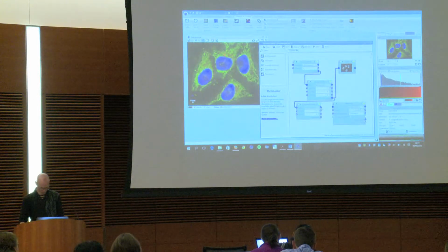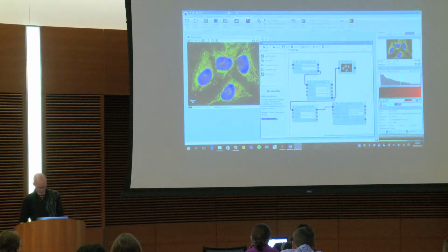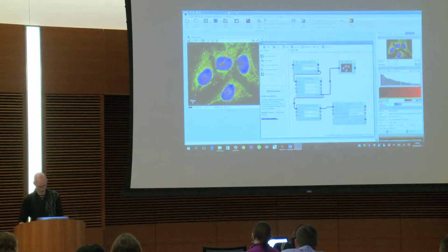Okay, so you can take the input directly from the previous block. This is not a result. This is just a simple bridge in this case because the input is not modified. But instead of taking it from the Gaussian filter, you can directly take it from the previous block. It just makes the link less messy.